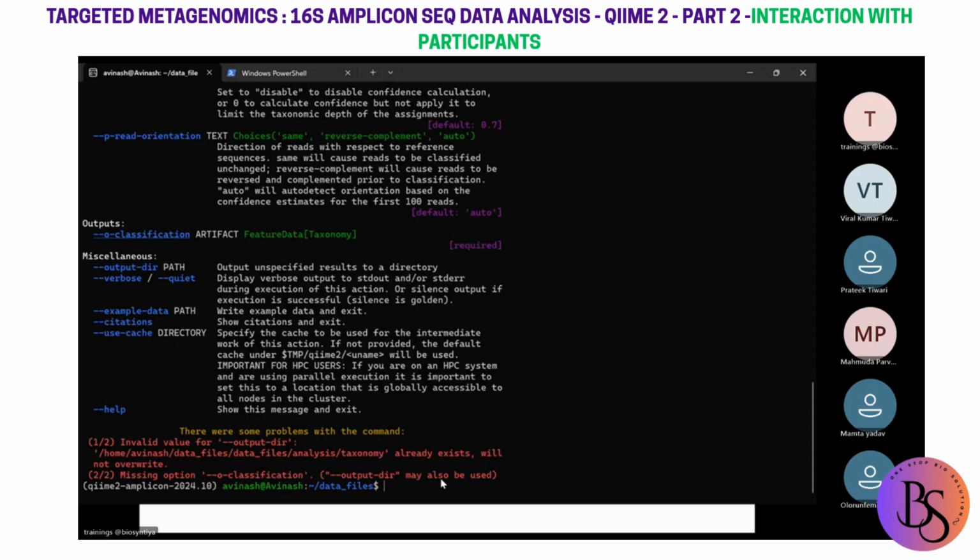Secondly, I have also truncated this data. Do you guys remember how many FASTA sequences did we have? How many features did we have? We had around 490 features. I have taken the first 50 features from my data. Okay. I'll be sharing that file with you. You have to perform this step on that file, and whatever next steps that we are going to perform, you will perform on those truncated data sets and see what the difference is. Okay. Is the task clear to everyone?